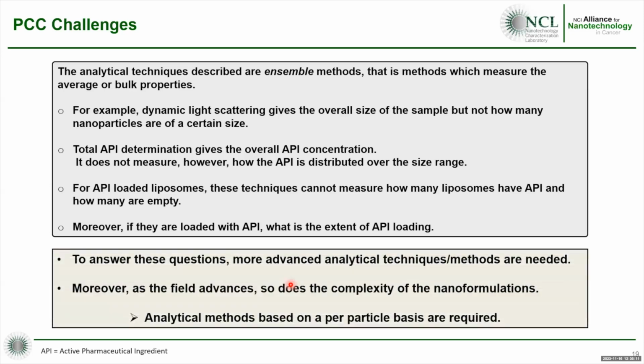And I think where the field is moving towards is that we need more advanced analytical techniques because the formulations are becoming more and more complex. And I think the field needs to move into a per particle basis characterization. So we need methodology for that.